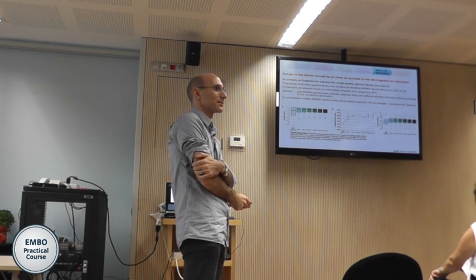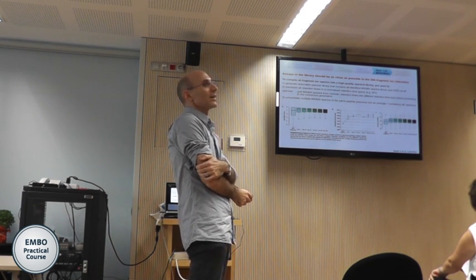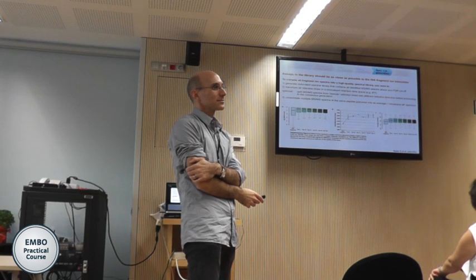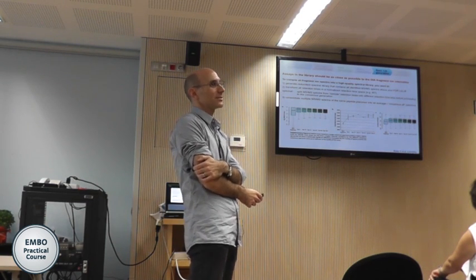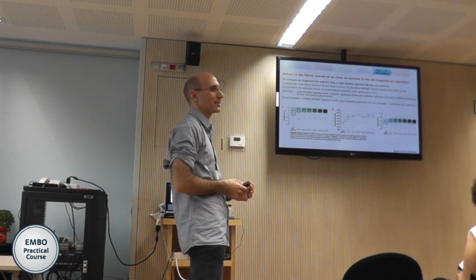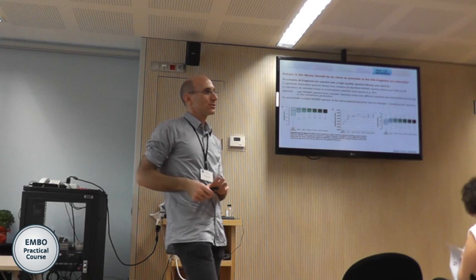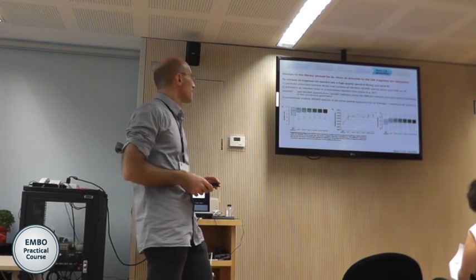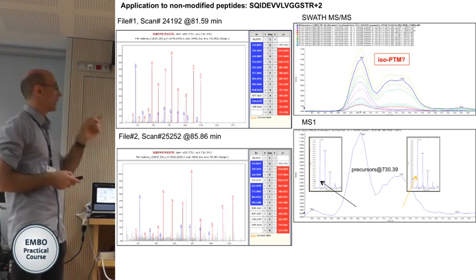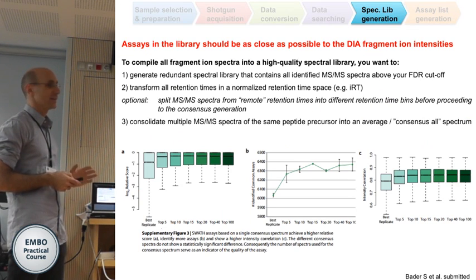Another thing that we do in Skyline is that I saw a number of peptides in several runs where things were coming out in the wash. So you'd have an ID and then you'd have something way far away in the wash. So I have an algorithm to detect that. You don't want to merge them together with your right retention time. Basically, if it's closer to the end than it is to the other peaks, we just trash it, completely discard it. But I still think some of them might have some biological relevance, but I haven't yet had time to investigate this in detail.